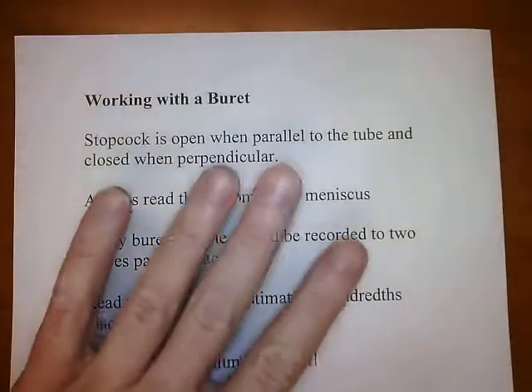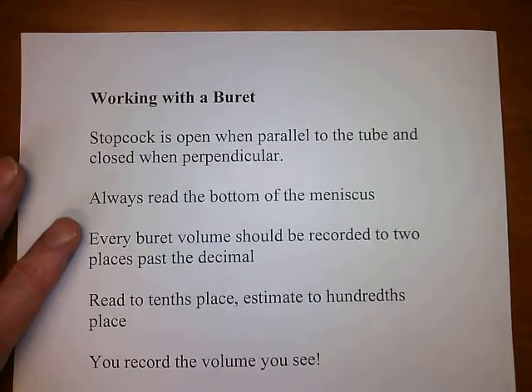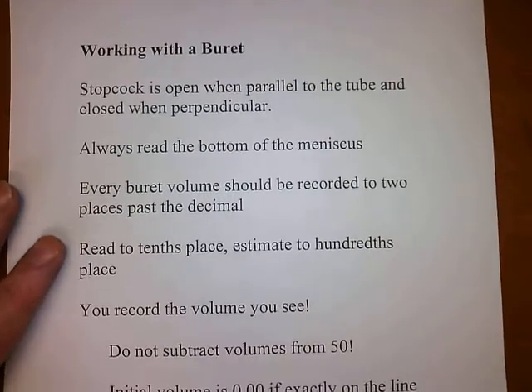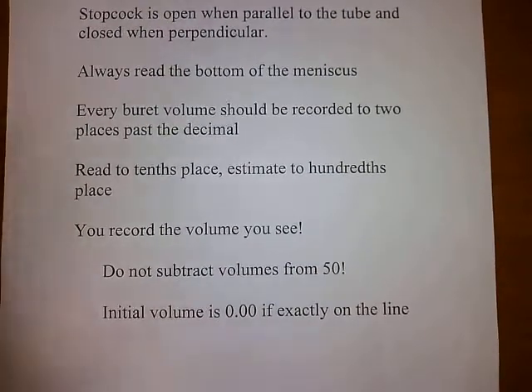Okay, so one more time. Stopcock is open when it's parallel to the tube and closed when it's perpendicular. Always read the bottom of the meniscus. Record every burette volume to 2 places past the decimal. Read to the tenths, estimate to the hundredths, and last, record the volume you see. And that concludes this lab lecture.